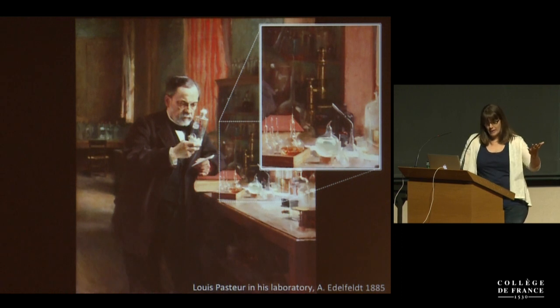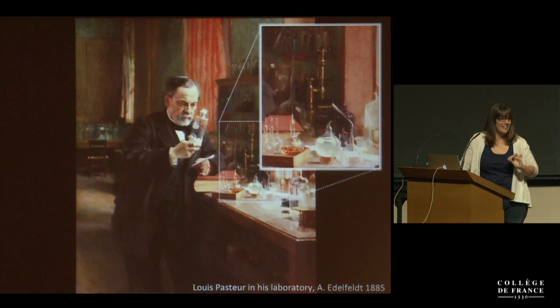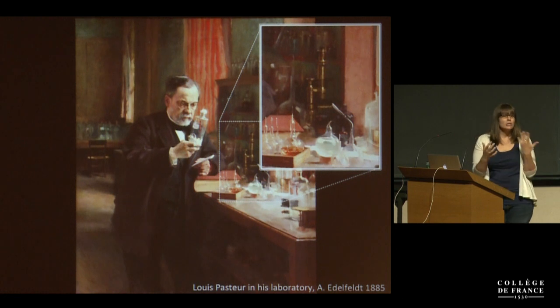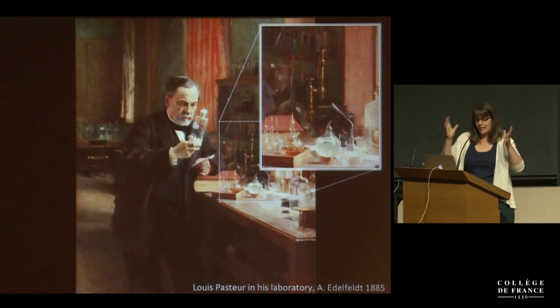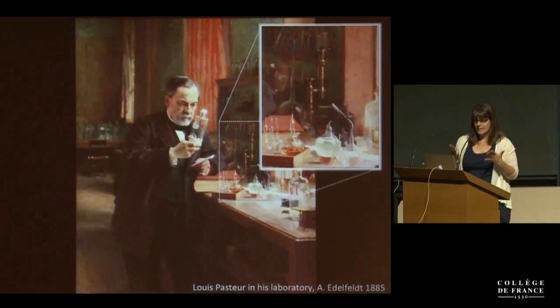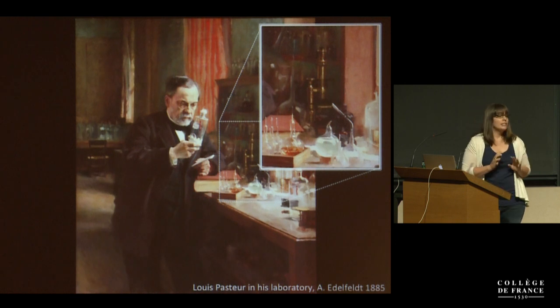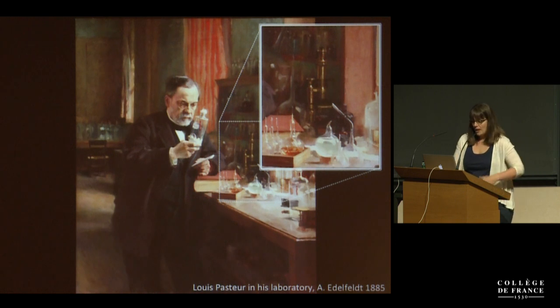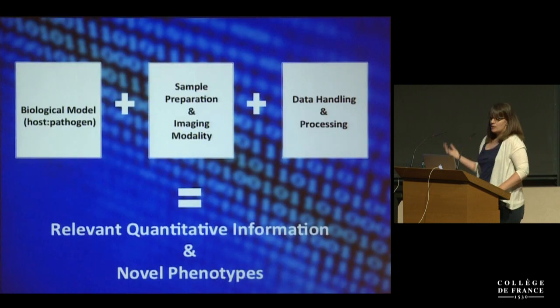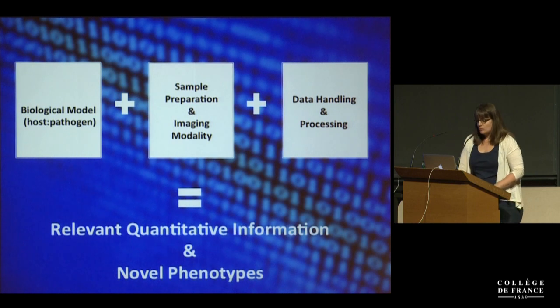But unlike during the days of Pasteur, when physically drawing an image was the mode of capture, we can now capture images digitally. So these acquired images are in fact multi-dimensional data sets, so we have to look at them differently and think about them differently now. And they really harbor statistically relevant data. And the task now is to computationally extract that information. And we can apply these techniques to better decipher the complex interplays between host and pathogen, and moving beyond mere observations of times past.